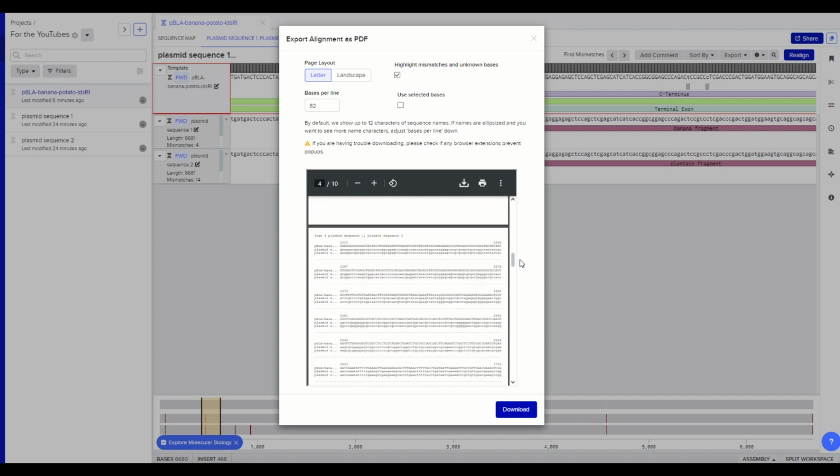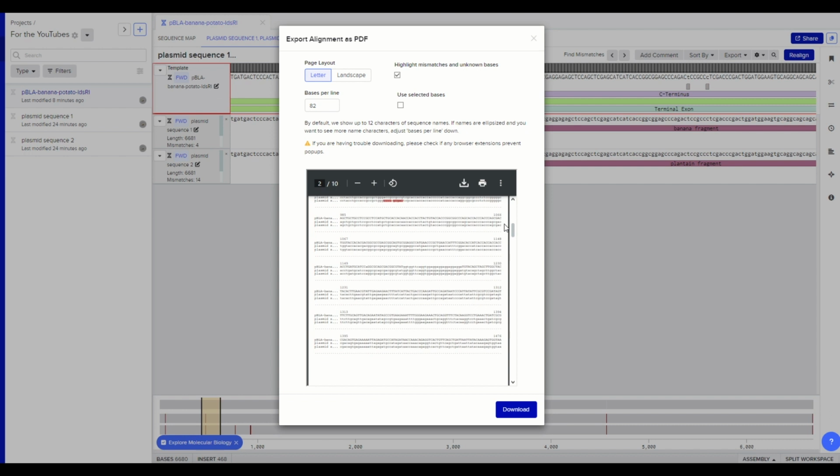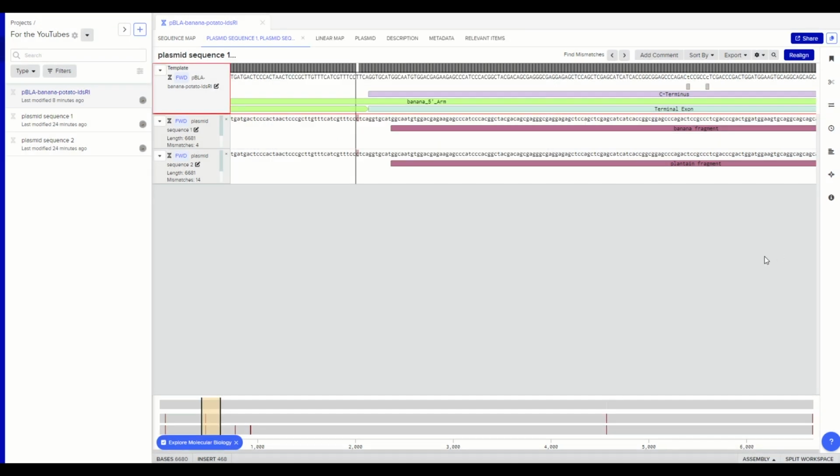If you want, I prefer to actually print my sequences out and keep them in a book with handwritten annotations for mutations and whatnot. So, let's go do BLAST, which is the least nice to work with, but is always available, right?